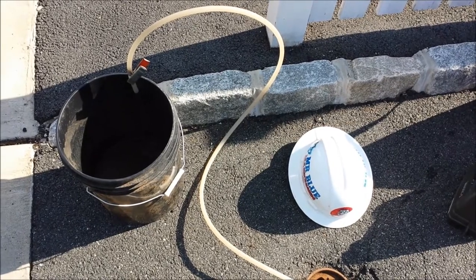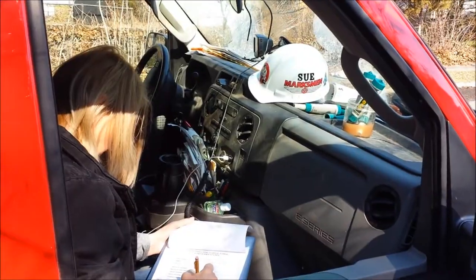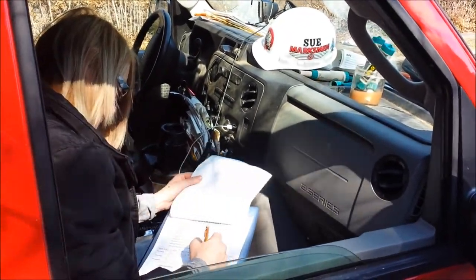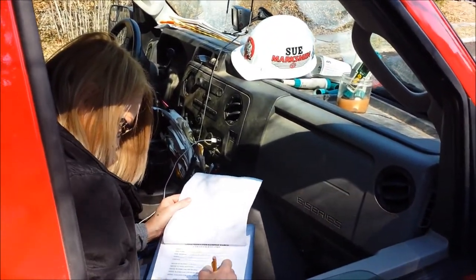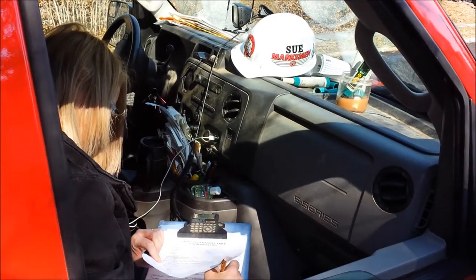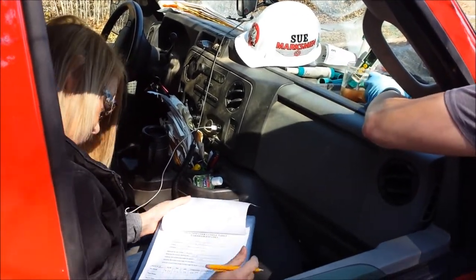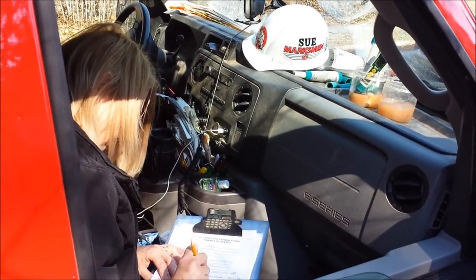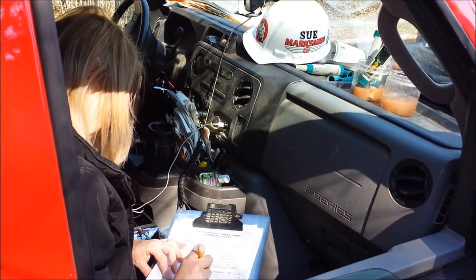We've already pulled a sample for physical parameters. Here's Sue in her qualitative mobile laboratory. The DEP permit requires that we collect what are called physical parameters for each monitoring well — before purging, after purging, and before sampling. What she's going to be looking for is dissolved oxygen (DO), pH, temperature, and conductivity. We'll be shuttling these samples to her all day long.